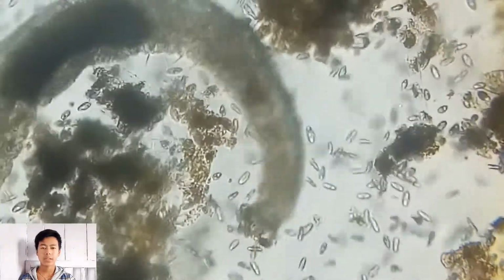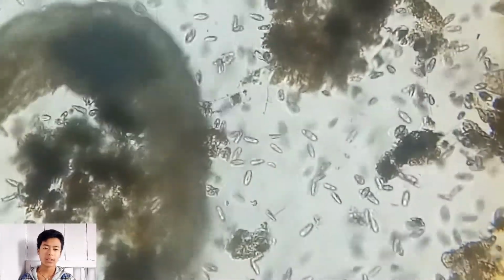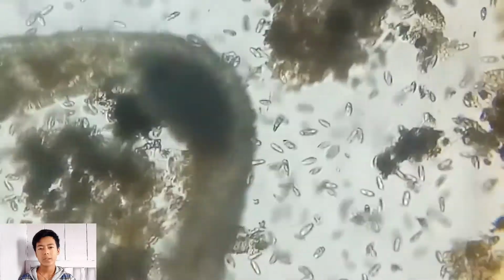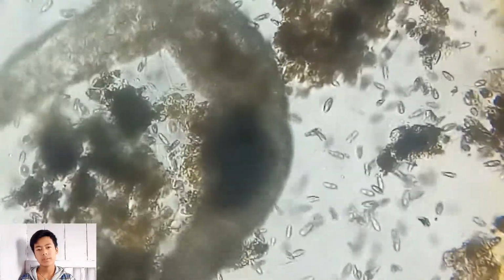So friends, as you all can see, this one drop of water has many organisms in it. So it has been like a culture of the ciliates.